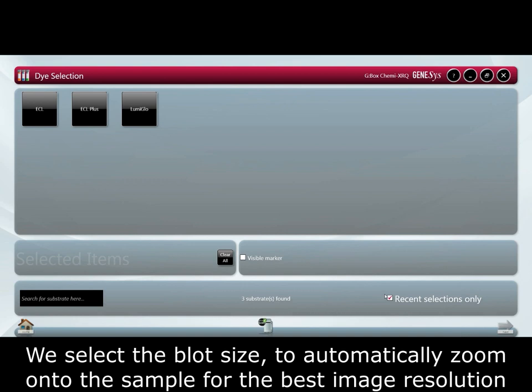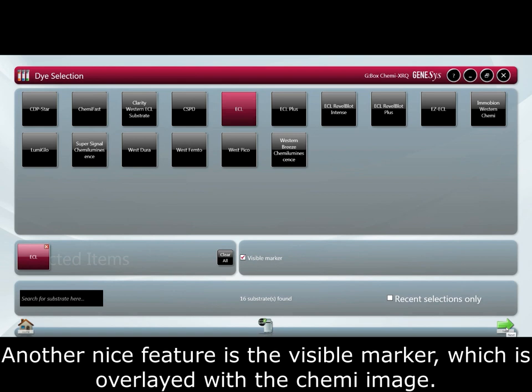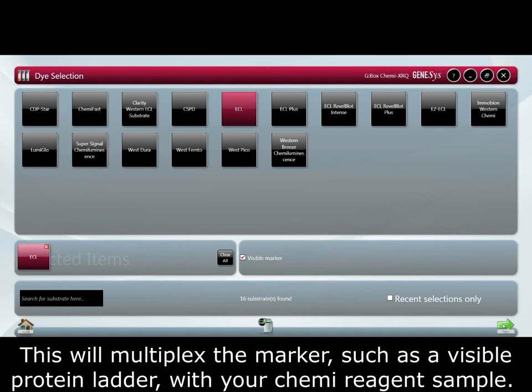We select the blot size to automatically zoom onto the sample for the best image resolution. The reagent used on the blot is then chosen so that when you refer back to the image later, the protocol is saved. Another nice feature is the visible marker which is overlaid with the chemi image, multiplexing the marker such as a visible protein ladder with your chemi reagent sample.